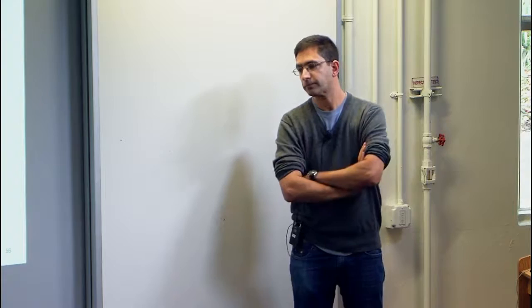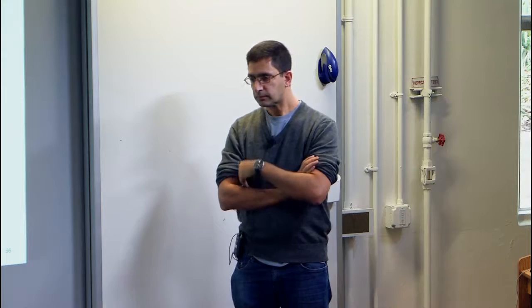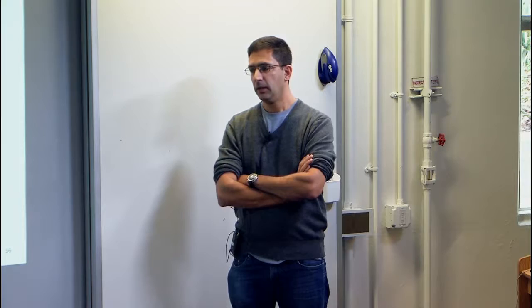Take this idea of pseudo-alignment instead of alignments, because of course with any of your favorite seq assays like ChIP-seq, you would want to know where it comes from. And so even for gene expression, when you talk about alternative splicing, that's already sort of a gray zone, right? You could think of each exon as its own target essentially, but often there you already care how many reads are actually spent on the exon junction, and so for that you already need to know some position information and not just the assignment. So how far do you think that paradigm takes you?